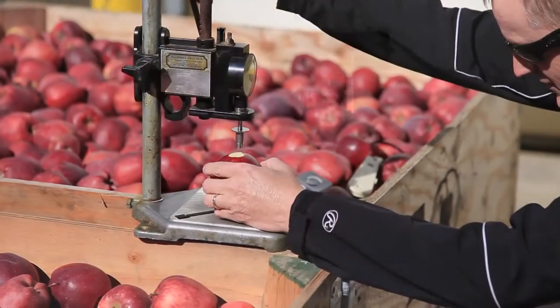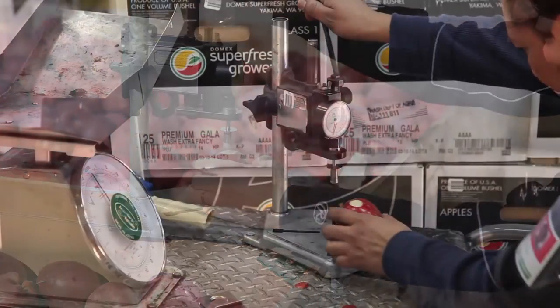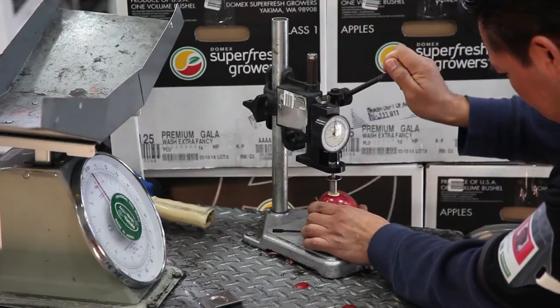We test pressures throughout the entire chain, from harvest to shipping, to ensure that the consumers get a crisp apple and retailers get the optimal shelf life.